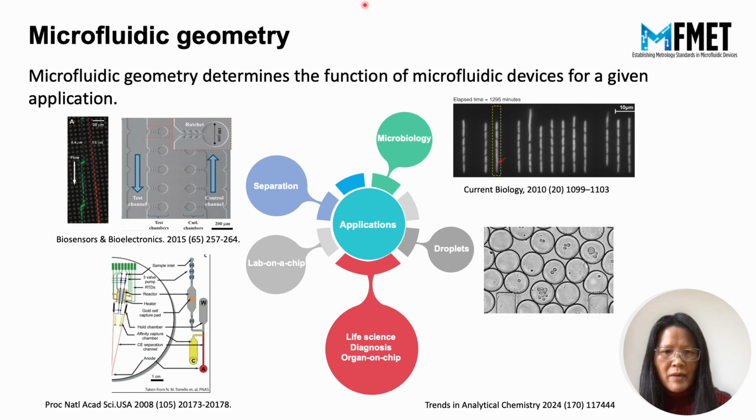For example, microfluidics has been used for cell sorting, total cell analysis, studying bacterial response to antibiotic resistance, or generating droplet-based bioreactors. In all these applications, manipulating cells and flows within microfluidic devices depends on their geometrical characteristics.